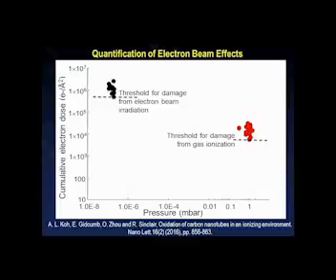I think for in-situ experiments, there's a lot of planning and a lot of consideration to be made before starting the experiment itself. Let's say, for instance, you want to find out the oxidation or hydrogen absorption, how are you going to measure it? What will be the change in properties as a result of hydrogen absorption? Is it a lattice expansion? Is it a shift in plasma resonance? So first of all, you have to identify what the best technique is for your experiments.